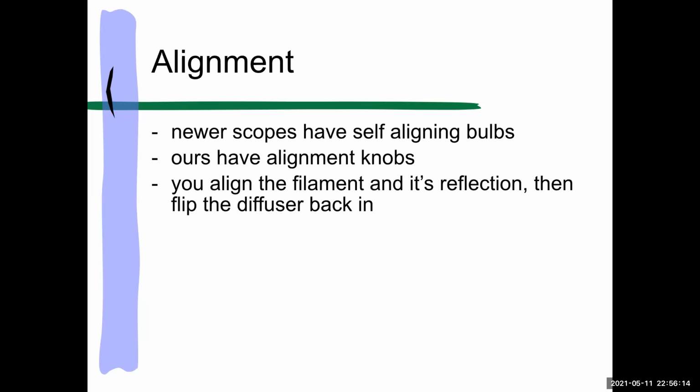Anyway, what else? Bulbs. So aligning bulbs is another thing you might come across. I just want to make sure that if you're in an internship and they say, let's align the bulbs, you know that it's a thing. So this is the arc lamp bulbs. For whatever reason, I guess they're hot and they tend to wander around.